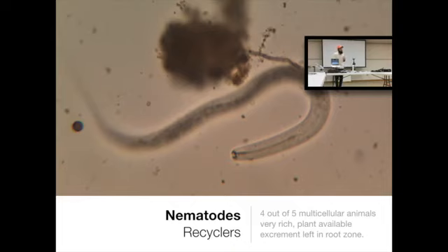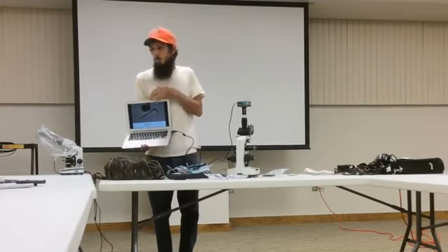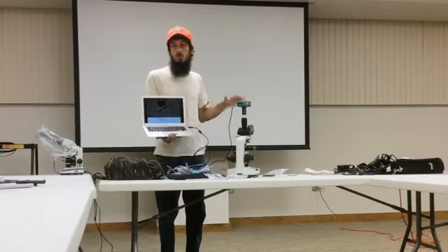The other really exciting thing that you'll see, and this is another good measure of soil health, is nematodes. Kun-Hu Wei, I think that's how you say her name, studies these nematodes specifically because you can see them at 100 times power, and they tell you a lot about the soil. They're little miniature snakes swimming around. A lot of times people associate nematodes with bad guys, but typically only root feeders are bad for farmers, and these guys are everywhere. So having good, healthy nematode populations keeps your root feeders in check.